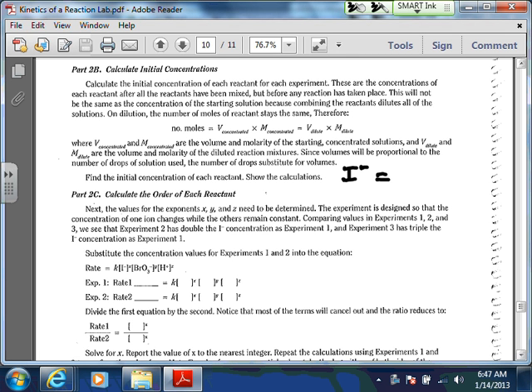Yes, potassium iodide solution is 0.010 molar. That's on page 153 at the very beginning. So then you would take that initial concentration, 0.010 molar, times your first volume, which is going to be 2 drops. And then we set that equal to our M2 times 12 drops. So then basically to solve for M2, we're just dividing by 12.